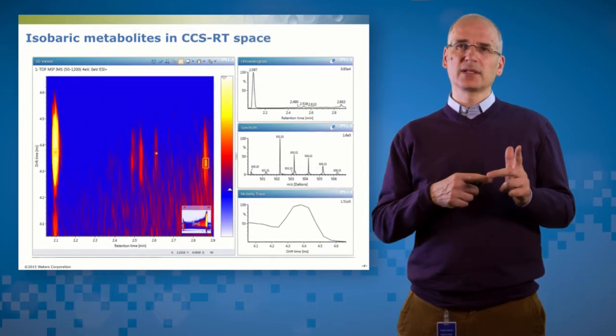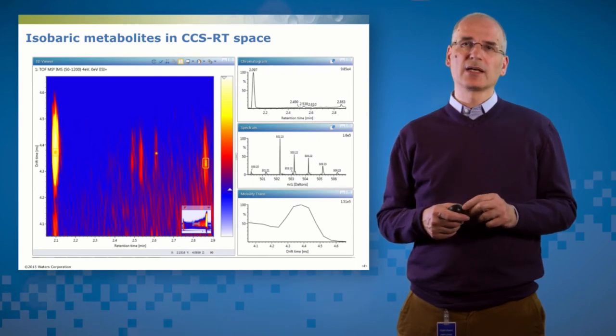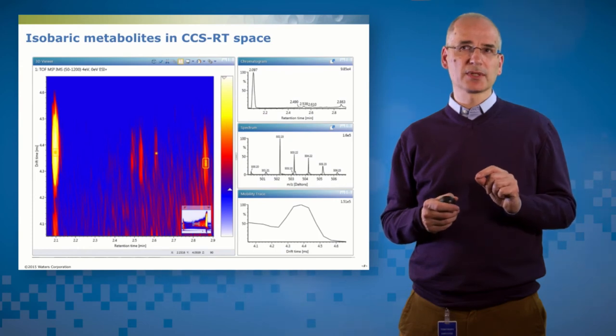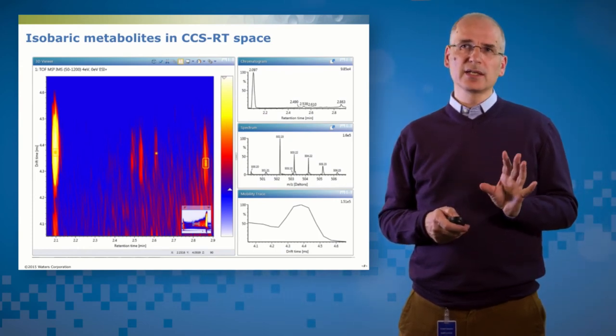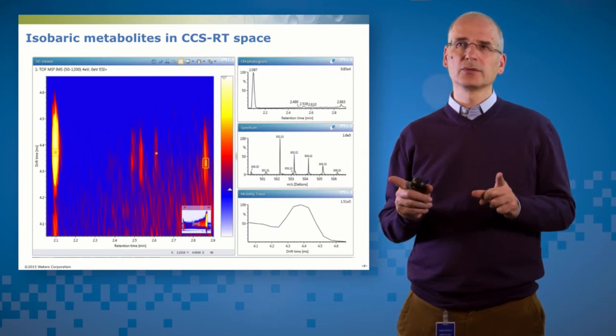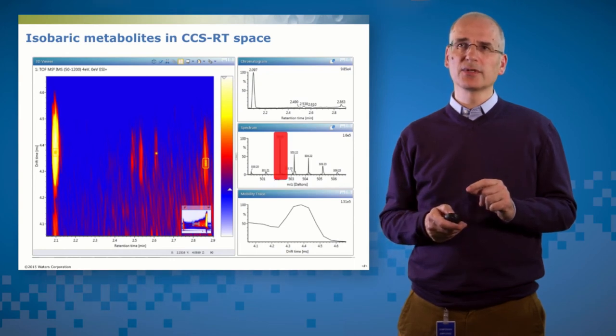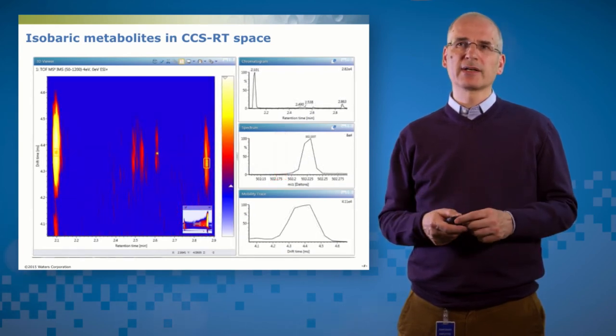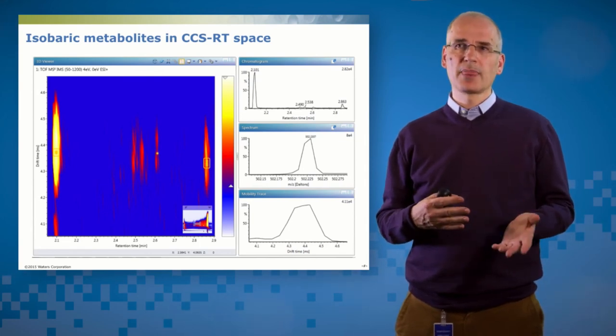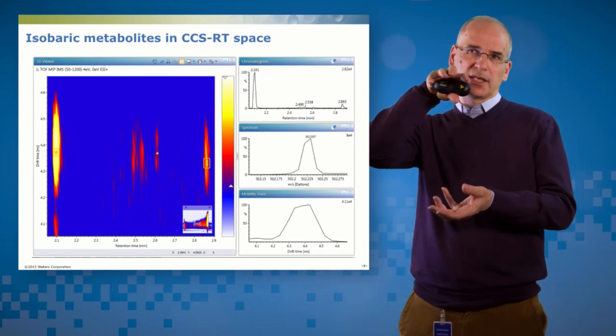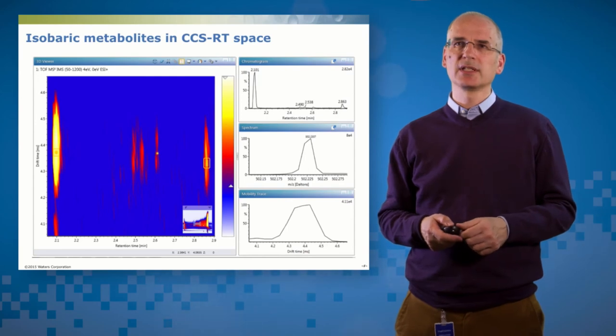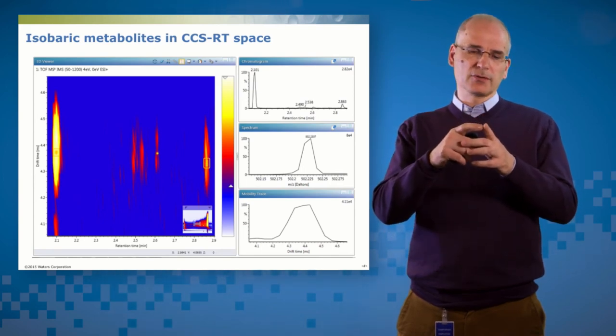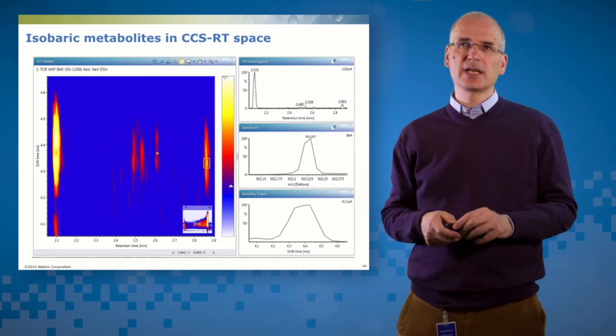And if I switch now into looking at CCS on the y-axis and retention time on the x-axis, now those isobaric metabolites have got different sizes and shapes. And so they have a different CCS value. It's a little bit noisy at the moment, and that's because I'm selecting a rather large spectral window, mass spectral window, to generate this view. But if I just focus on the C12 isotope peak and zoom in on that one, now a lot of that background disappears because the intensity is coming from background signals. I'm taking actually a box down through the plot when I look at this. So that's given me more selectivity. And when I measure the CCS value, the software is doing an automatic analysis of the volume of the peak, I get different CCS values, even though they're isobaric.